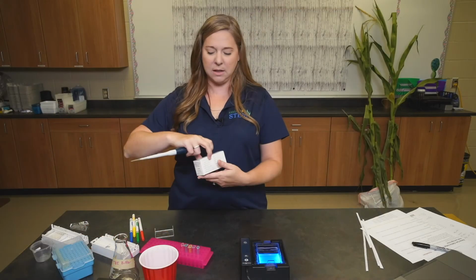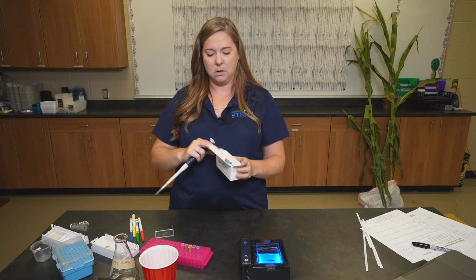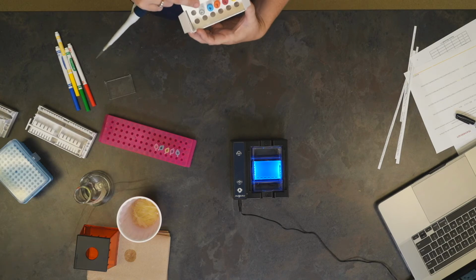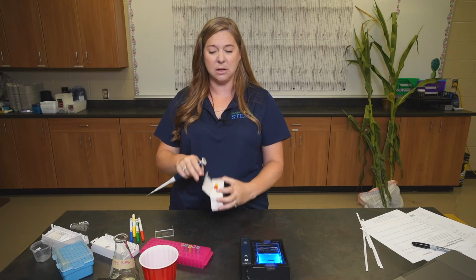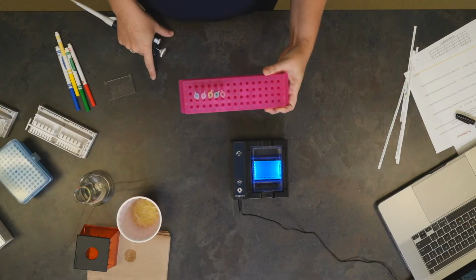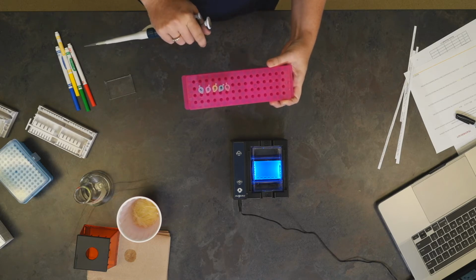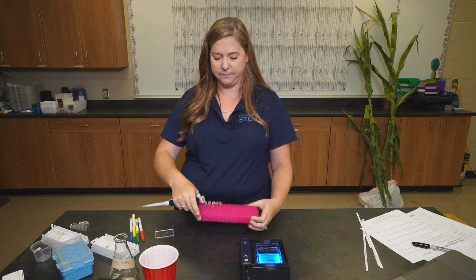As a teacher, your DNA samples are going to come in your consumable kit and look a little something like this. Each one has a color-coded top, and I number the top so I know which one I need to make sure gets in each place. I go ahead and aliquot out all of the samples into a smaller container that also comes in the kits for my students. So my students will have a rack that looks something like this with numbers 1, 2, 3, and 4. Each one is in a different color of test tube, but most importantly are those numbers. This indicates the order at which they're going to get put into the wells from left to right.